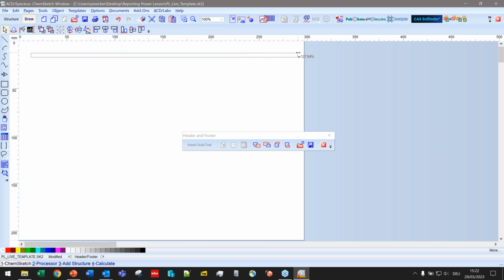And I'm going to make it the size of my document. I'm adjusting both the sides of this header here. Doesn't want to let me do that. Here we go. All right, and the last thing that I want to do is I want to center this. So let me select it all, so Control A, and center this, and there's my header.